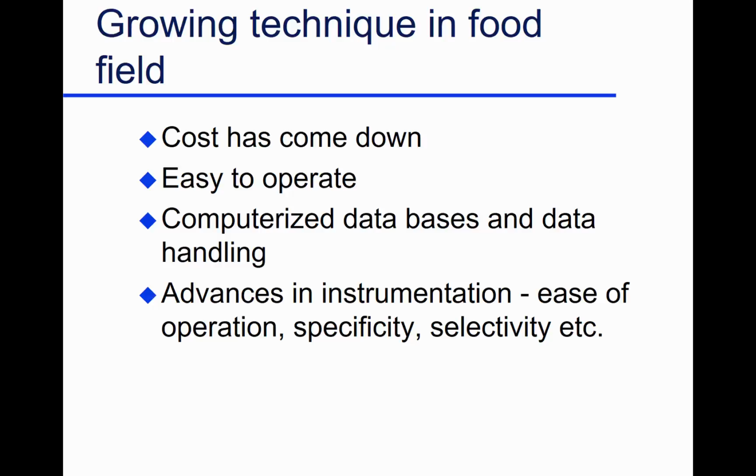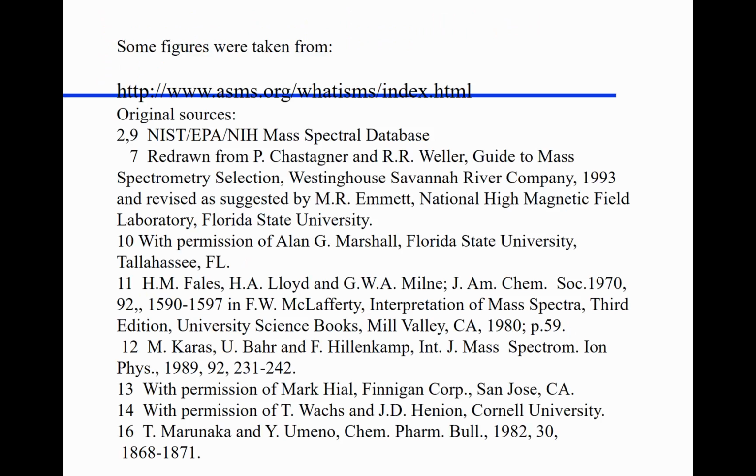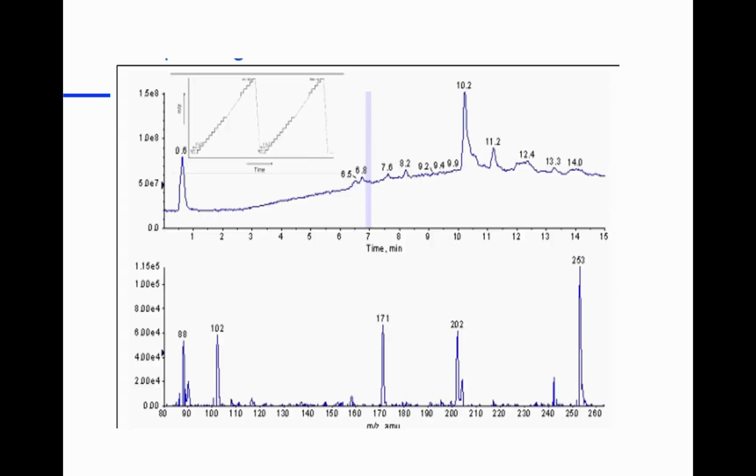You have to keep in mind ease can also be a hazard. Anybody thinks they can do it without thinking about it. Computerized databases, data handling, advances in instrumentation. Really, like I say, there's a lot that's been done that explains why it is such a popular technique. So with that, there are some references that I took the presentation from, so you can take a look there.